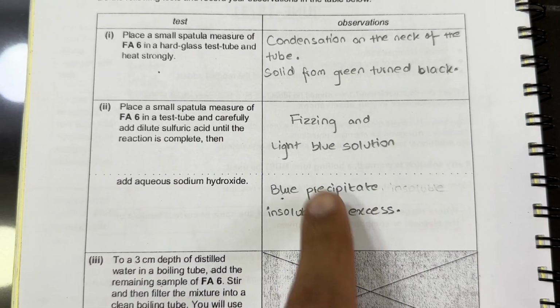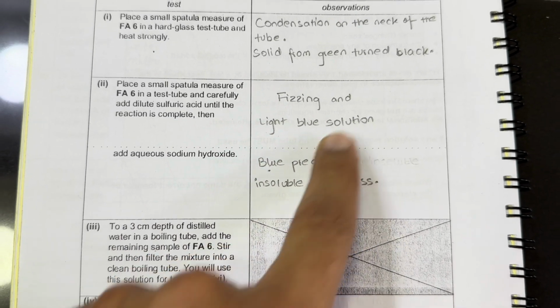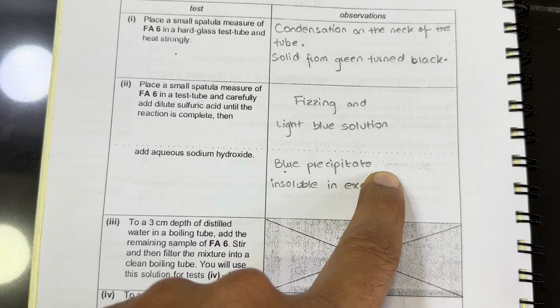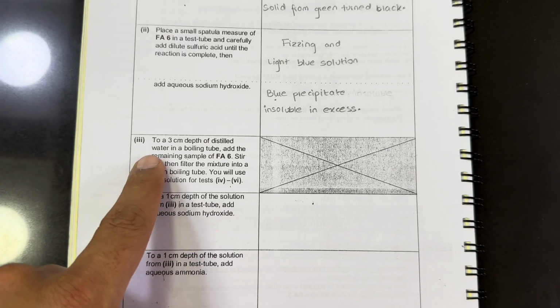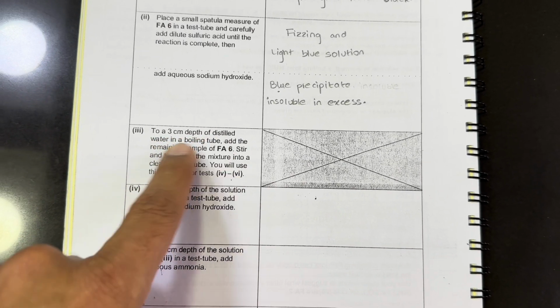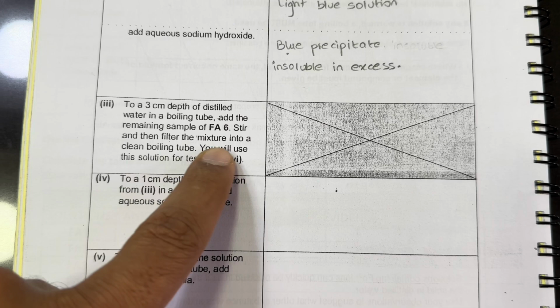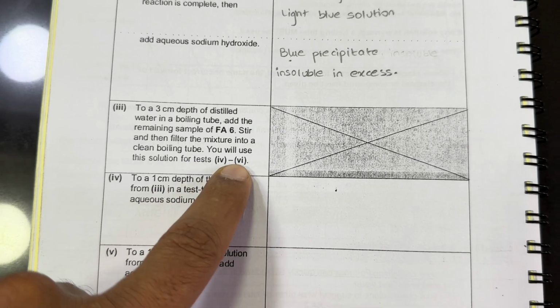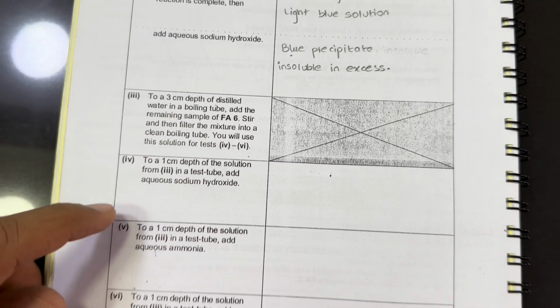Now we have recorded this observation here that fizzing happened followed by light blue solution formed. Then upon adding sodium hydroxide in the same test tube, we got blue precipitates with a few drops of sodium hydroxide, and the precipitates remain insoluble in excess. Proceeding to the next test, we have to add 3 centimeter depth of distilled water in a boiling tube, add the remaining sample of FA6, stir and then filter the mixture into a clean boiling tube. You will use this solution for the tests 4 to 6, and they have crossed out this box, which means you do not have to observe any change happening or not.